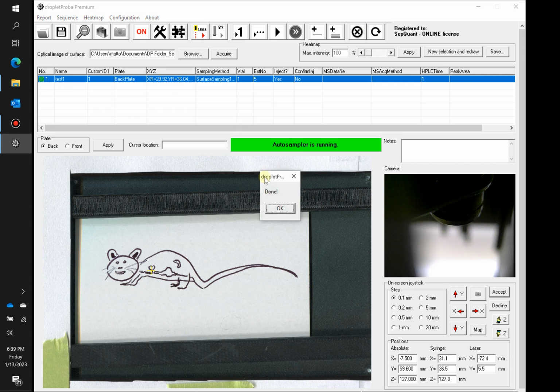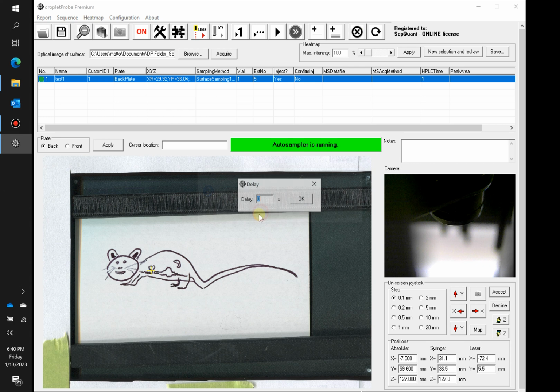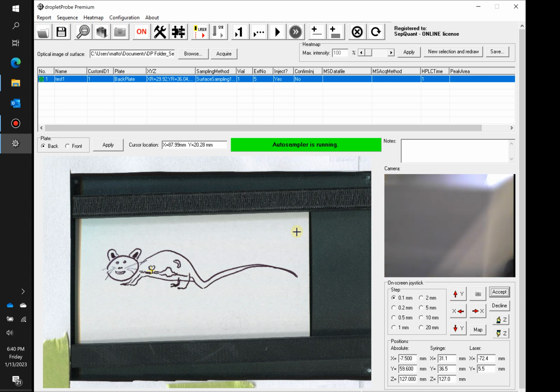I'm just going to start a run as an example of how this looks in this little live camera. I'm going to shrink this video down just so I'm not wasting all your time, but essentially this will allow us to look at a nice microjunction and see what this looks like.